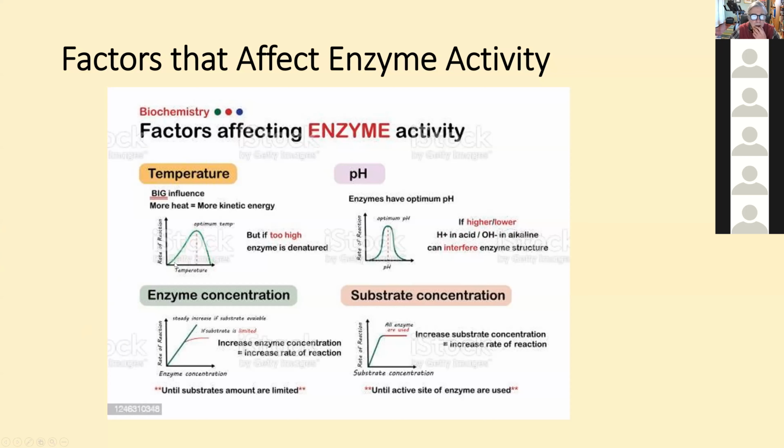Most people would say the enzyme activity is going to be greater at a higher temperature than a real low temperature, like between ice water and room temperature. Enzyme activity is going to go up from ice water to room temperature. Why? Well, remember what temperature measures: molecular movement.